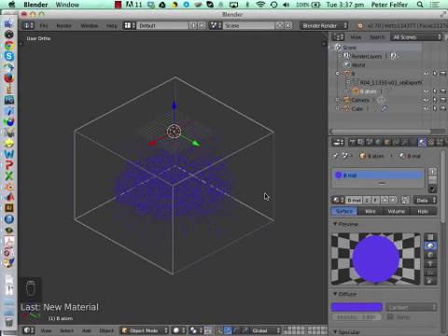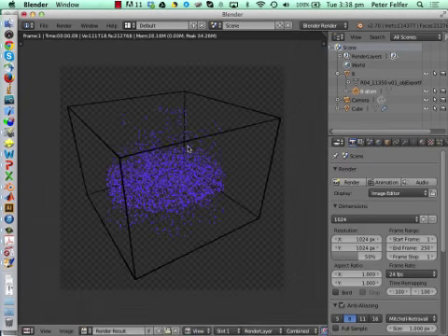You can actually load that material into different Blender datasets as well, into different Blender files as well. So I usually have one stash of materials, and whenever I render a new dataset, I'll just load all the materials for the different species over. And now it's all blue, and now we've got our atoms there, with the bounding box and everything, and that's a pretty good start for a render, I'd say.